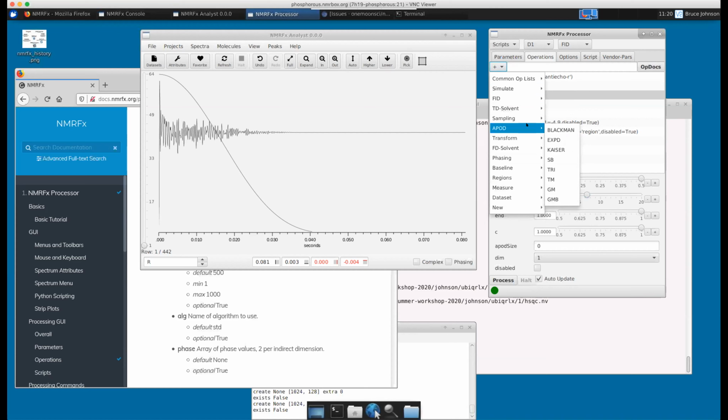So when we reconstruct the NUS data, is there anything like a bias or preference to one of these? That's also a good question, because there are actually different ways you can do the apodization. In fact, I have some low-level code that can incorporate some of the apodization functions inside the NUS processing itself.